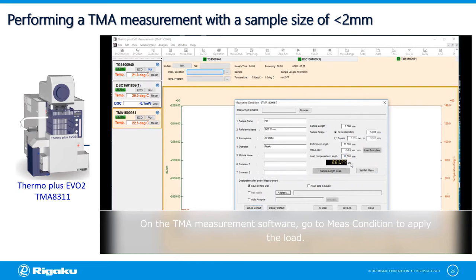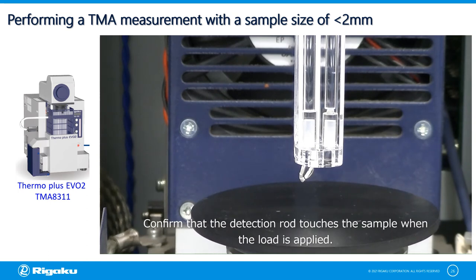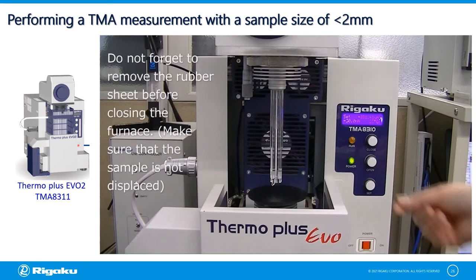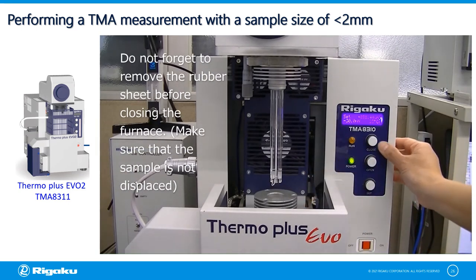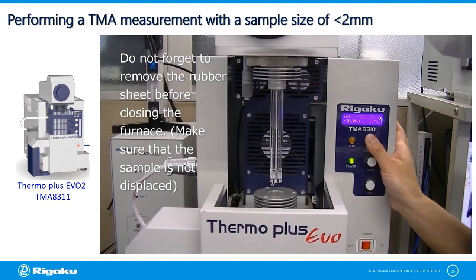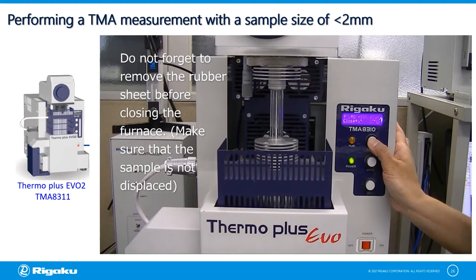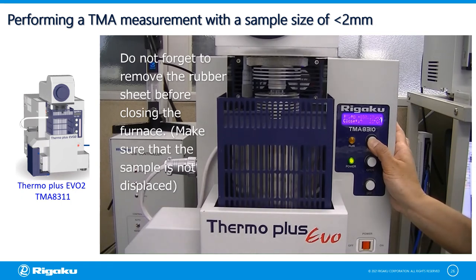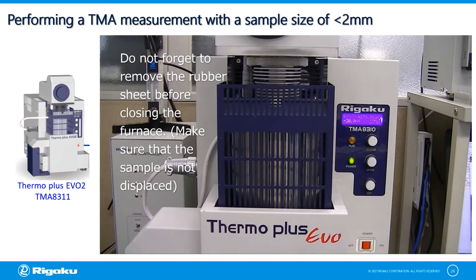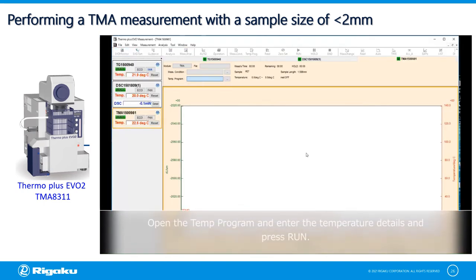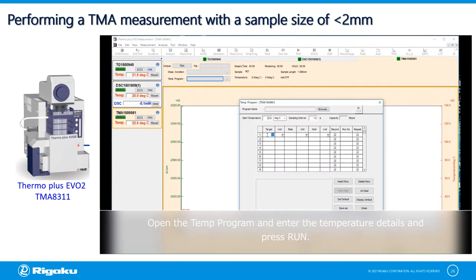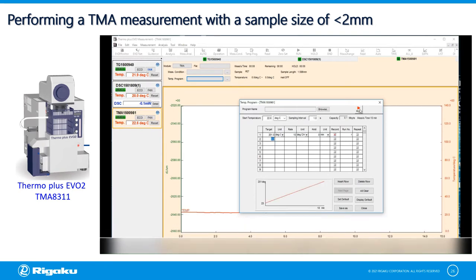The load compensation length is equivalent to the sample stage plus your sample material. Confirm that the detection rod touches the sample when the load is applied. Do not forget to remove the rubber sheet before closing the furnace, and make sure the sample is not displaced when closing the furnace. After closing the furnace, go back to the software and set the measurement condition such as temperature range and heating rate. Open the temperature program, enter the temperature details and maximum temperature for your measurement, then click run.